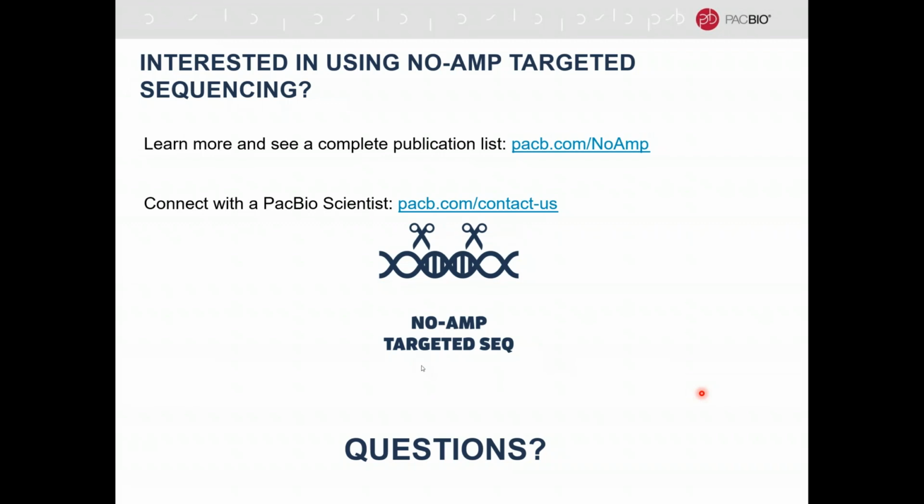The insert size is just more about what we see gets the most optimal loading on our instruments, and it does tend to like the larger fragments. So it's just adding more buffer sequence onto it, but you can go to as small of a region as you need to. You just have to add the buffer sequence to it.